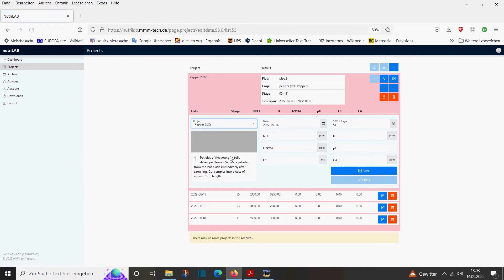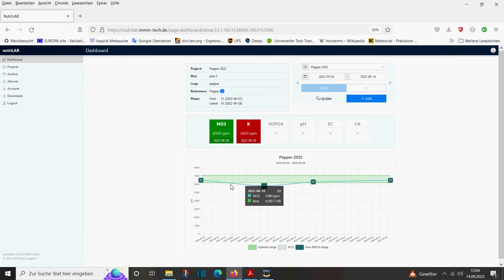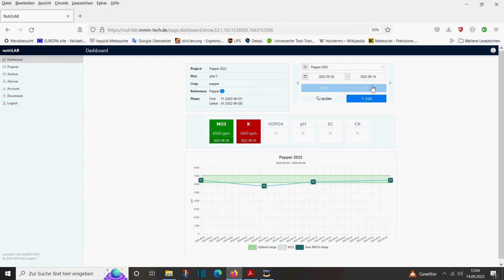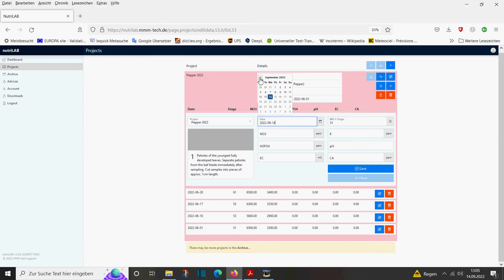After another 10 days we control the effect of our increased fertigation again — this is done on June 28th at BBCH stage 61. We measure a nitrate content of 6,500 ppm and a potassium content of 3,400 ppm. We save and control. We are now in the middle of the optimum range for nitrate, but for potassium we overdid it a little since we are now over the optimum range. This means we have to reduce our potassium applications a little bit.